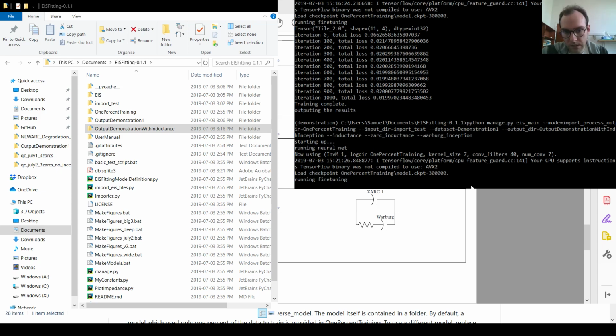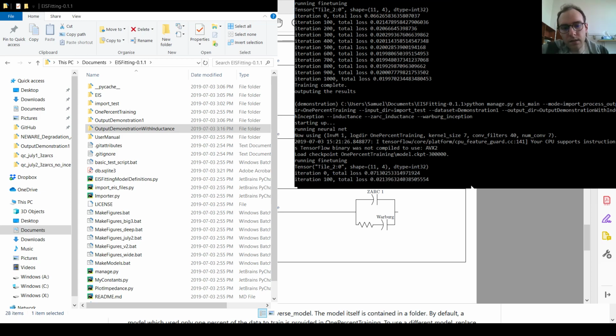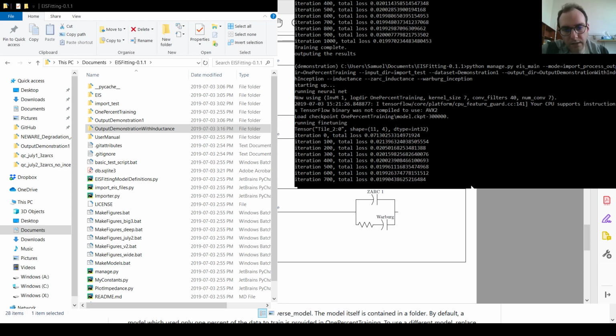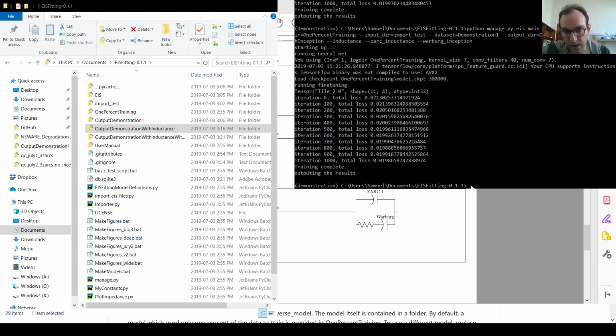The neural network is relatively fast if you have a lot of files, but here you just have around 8 files, which means that you only see the initial cost of setting things up. It's not much slower if you have 1,000 files, for example, but the optimization fine-tuning can take a bit longer, but usually it is a reasonable time.